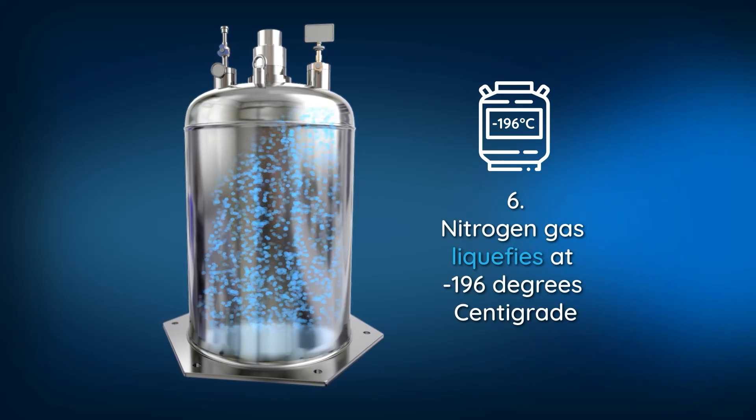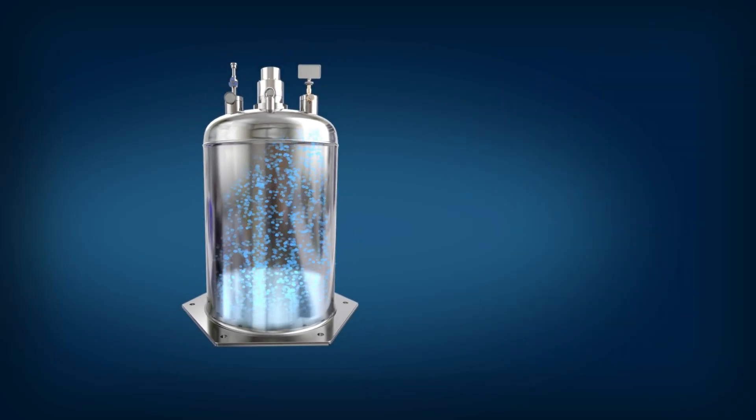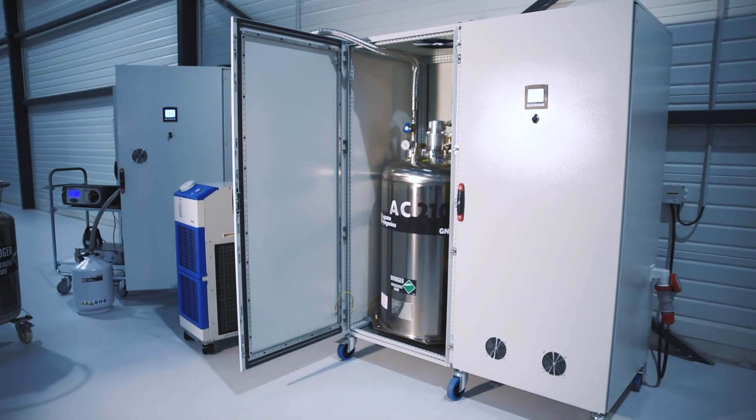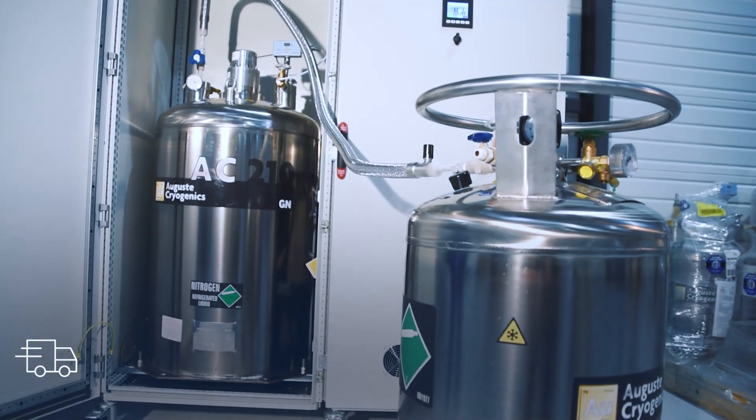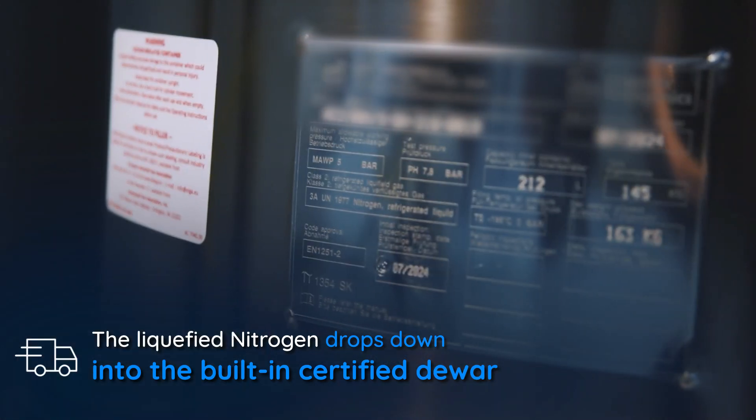Nitrogen gas liquefies at minus 196 degrees centigrade. The liquefied nitrogen drops down into the built-in certified dewar.